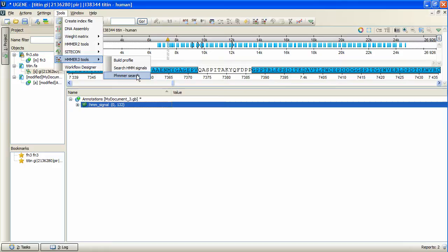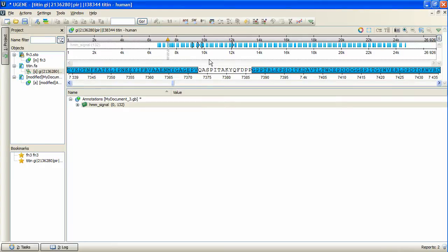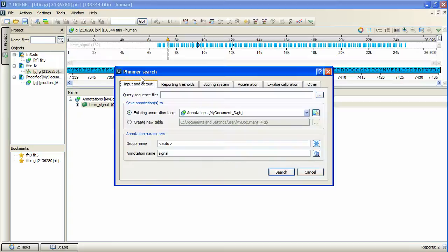The tool is called phmmer. The sequence to search in must be selected in the project view, or opened as a view. To invoke the tool, activate Tools, HMMER3 Tools, phmmer Search menu item.